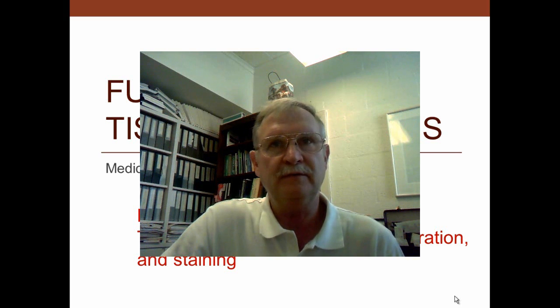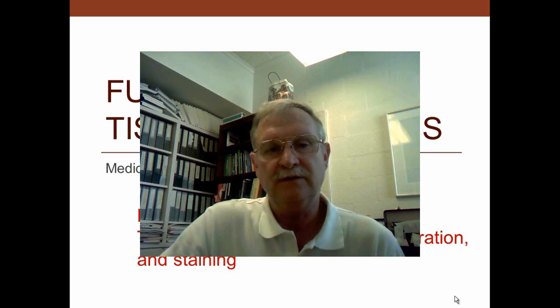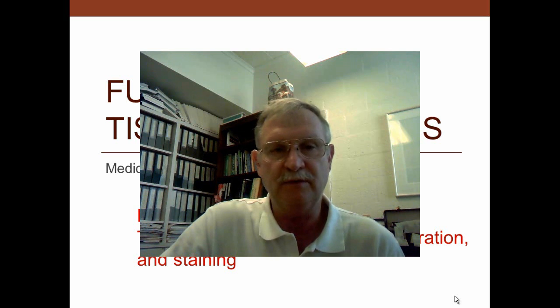Today we'll talk about the fundamental tissues and mitosis. We will have three parts. The first part has to do with a virtual microscope, how to identify things from the images by using the computer, describe the steps in tissue processing, and discuss the different types of microscopy, both light and electron microscopy. Then we will interpret cytologic features of cells by differential staining, with hematoxylin and eosin our main stain, but we also use PAS and toluidine blue, as well as processing tissue for conventional transmission electron microscopy as well as scanning electron microscopy.